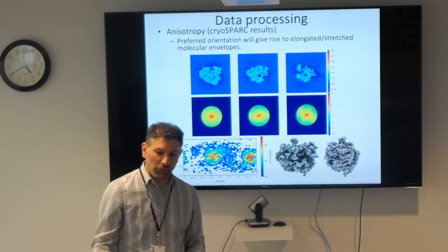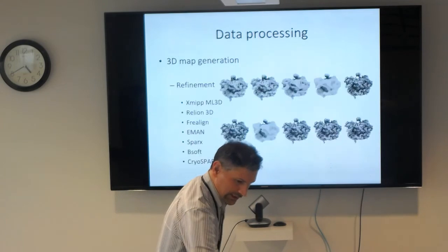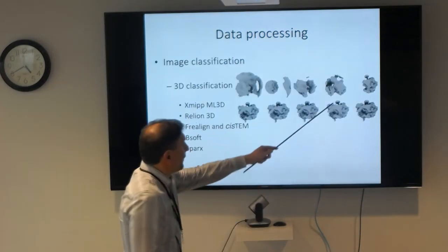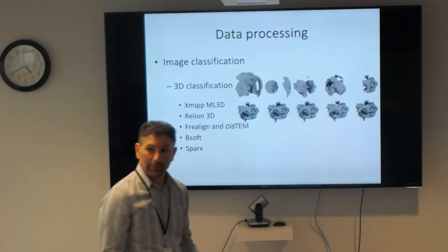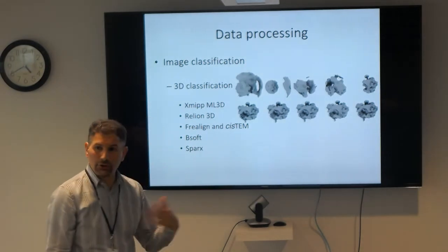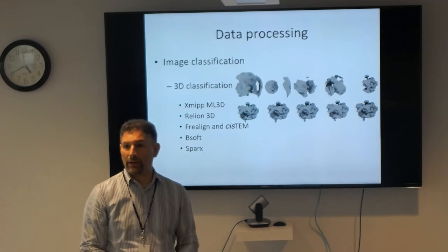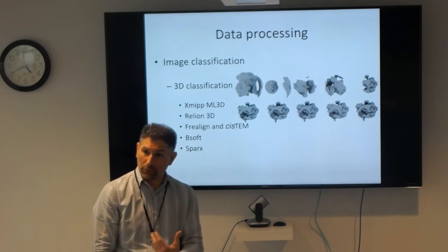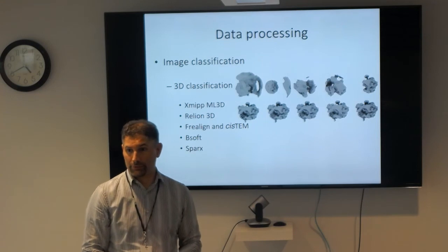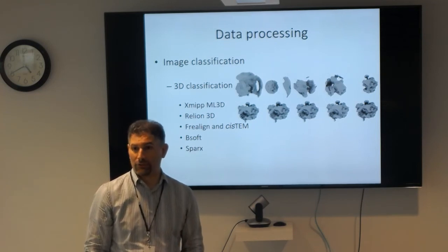So your first step is to clean out all the bad particles that essentially survive the 2D classification, right? To get rid of, for example, these guys and even that guy, okay? And then you take this, you could combine these together, and you can start doing that multiple times to essentially fish out the rare views and put all the rare views in one group. And hopefully all of those have the same configuration and some same conformation.